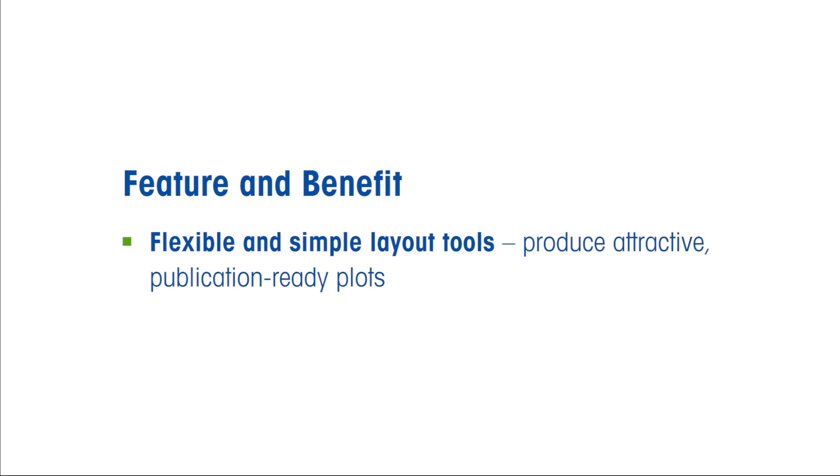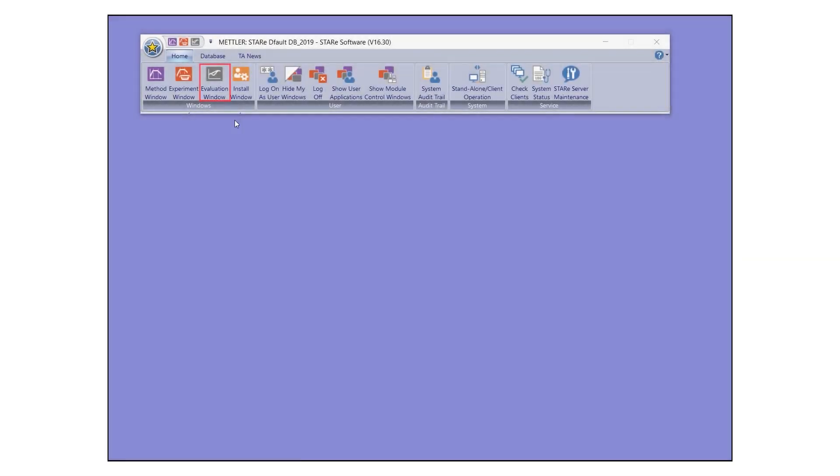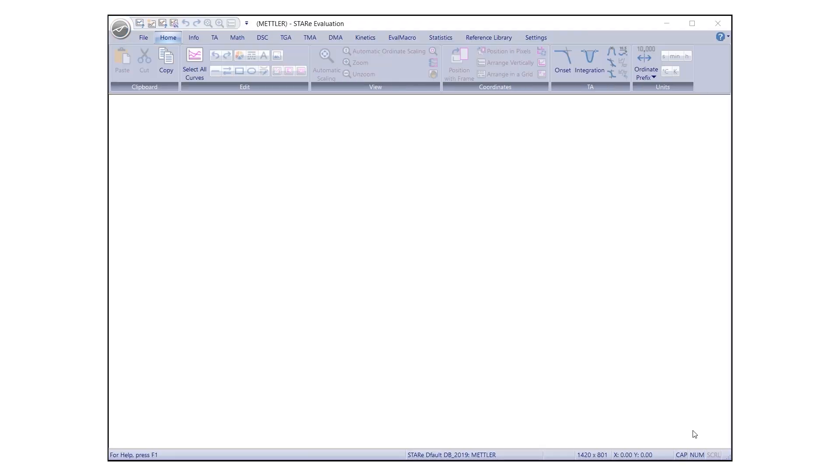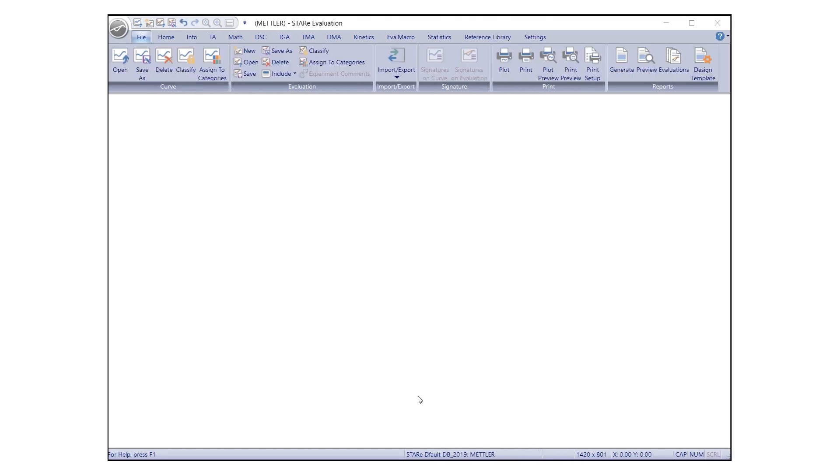In this video, we show you how to use plot design features in STAR-E software. To begin, open the evaluation window in STAR-E software and select an existing curve or evaluation. Don't forget to save the evaluation frequently to avoid loss of changes.